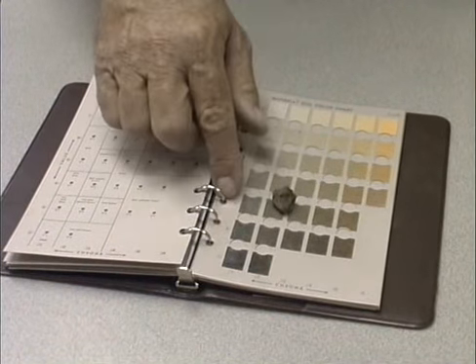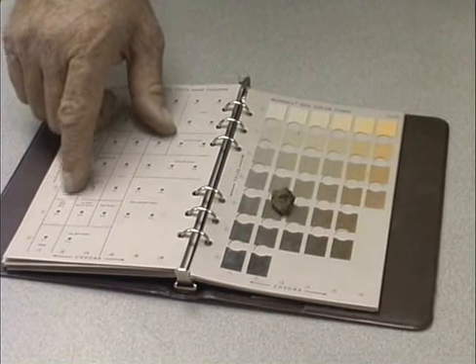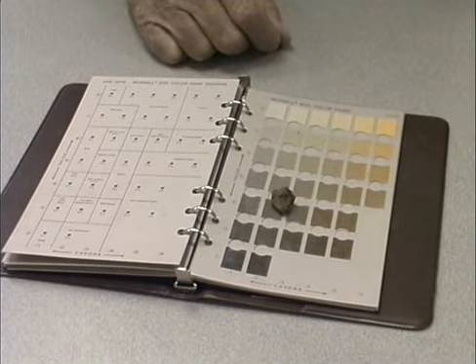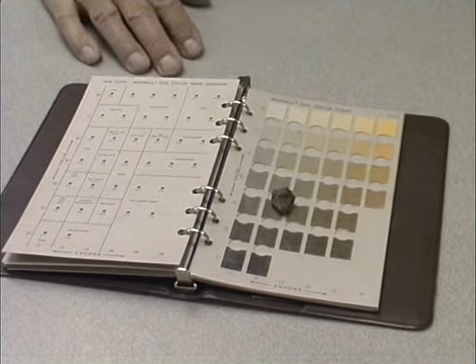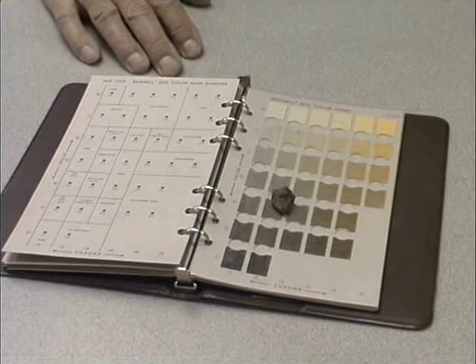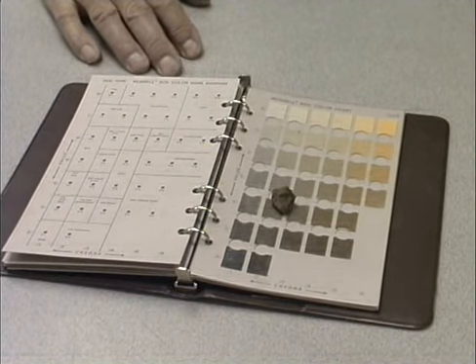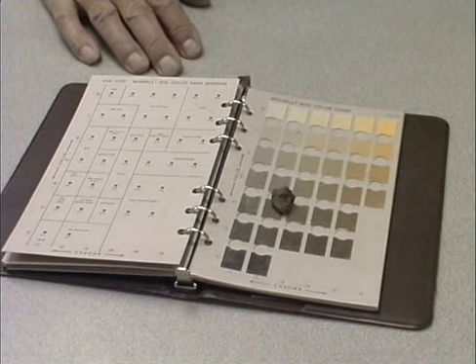This particular one, value of 4, chroma of 2. It's like the first sample we looked at. We look back and refer to that, and we're back to the dark grayish brown color. So when doing soil color, it's a matter of interpretation. The Munsell system can get us within a certain value range and hue and chroma range. That will vary based on moisture content for the same soil at a given point in time. Here today, to try to compare these soils at the same moisture content, we have air-dry samples.